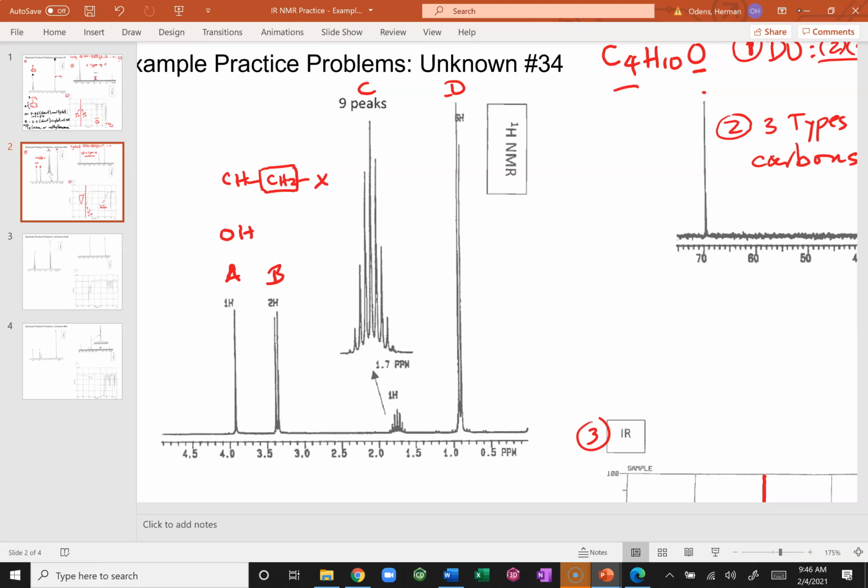For any milestone that I'll give you, if I know that you might not recognize these little things as peaks, I will tell you that you need to count them. So we're going to count those, okay? Because they're so tiny, they almost look like grass or NMR grass. 1, 2, 3, 4, 5, 6, 7, 8, 9. We had 9 peaks. Perfect.